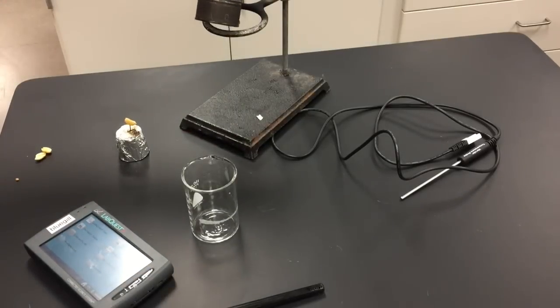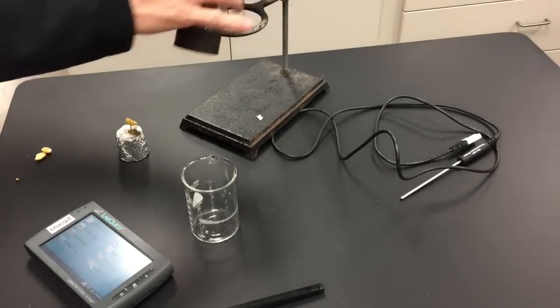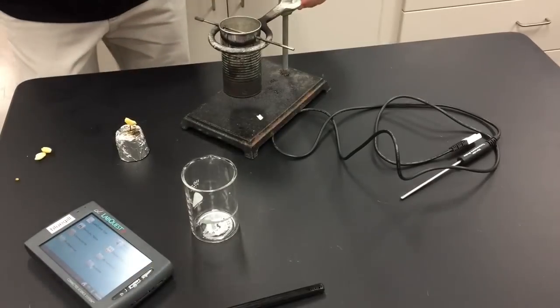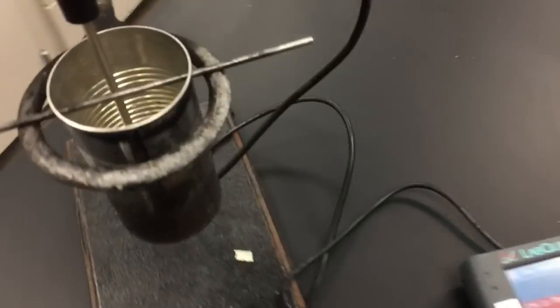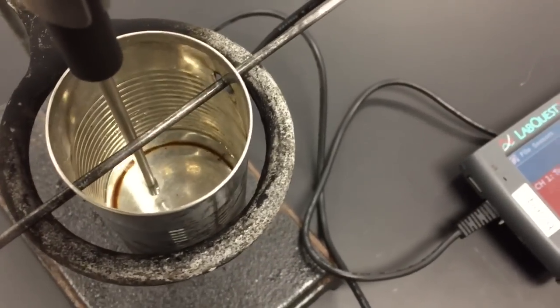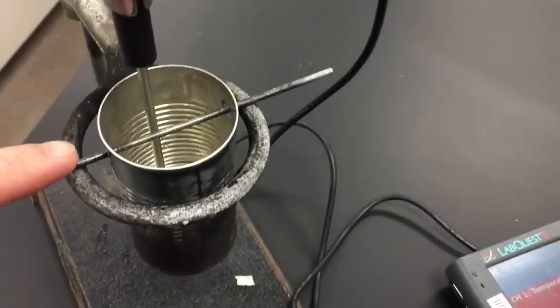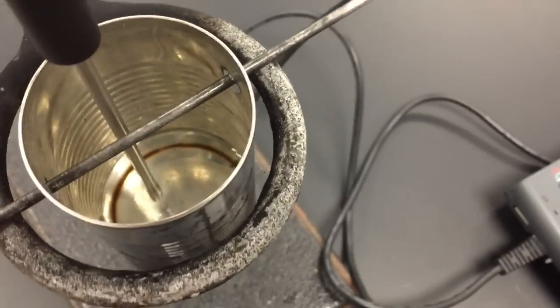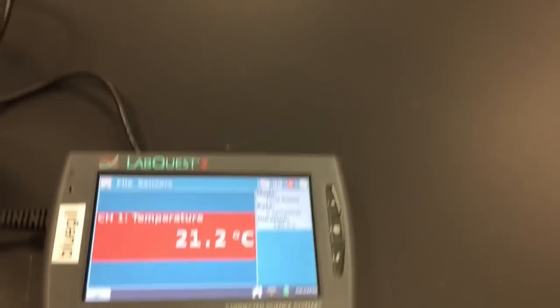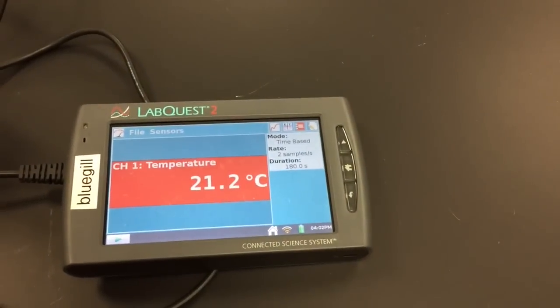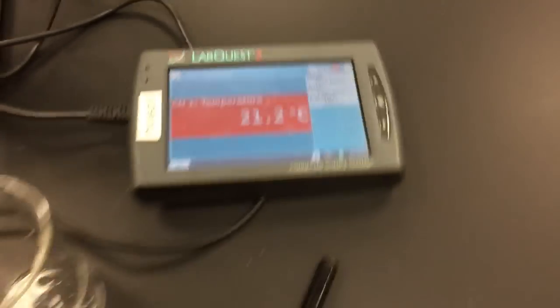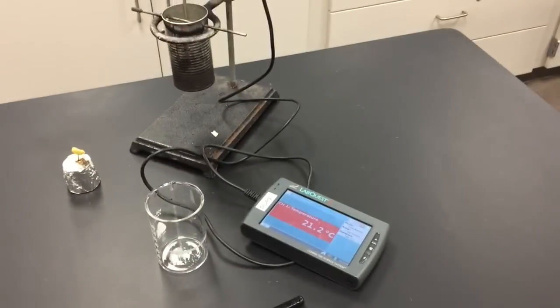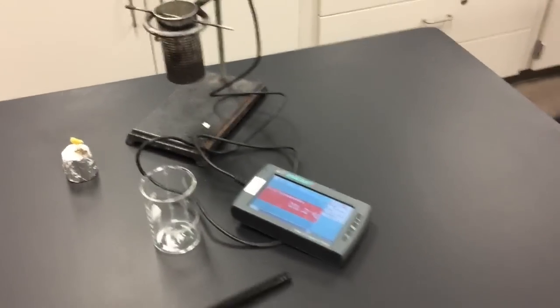I positioned the temperature probe with the clamp so that the end of the temperature probe, the tip of the temperature probe, is underwater but not touching the bottom of the metal can. Then I can write down my starting temperature of the water: 21.2 degrees Celsius.